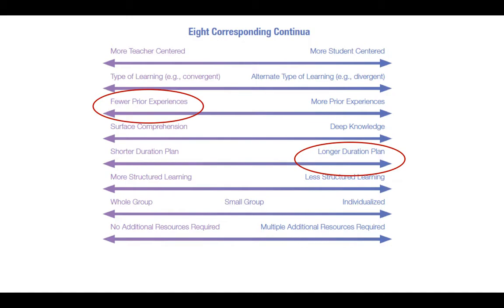Furthermore, we recognize that this is time-related information, so it makes sense to show this part of the procedure using a mode that conveys the passage of real time. We want an activity that will show that. We could use live action in our traditional demo activity to show students how long each of these steps takes.